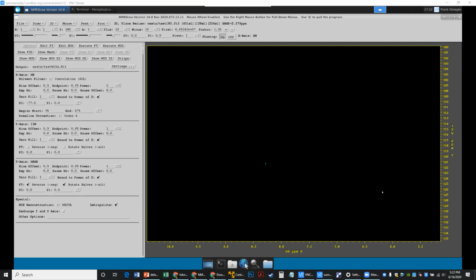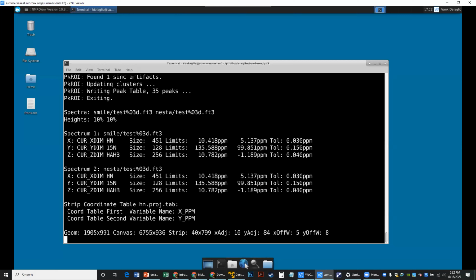Okay, Robert, I see that you've raised your hand. Do you have a comment or are you volunteering? Unmute your mic to reply. I was volunteering. Sorry, the press space thing works unless your cursor is in the chat window, and then it binds to that and never lets it go. Anyway, okay, yeah, I can try. Okay, very good. Thank you. I'm grateful that we have a volunteer.